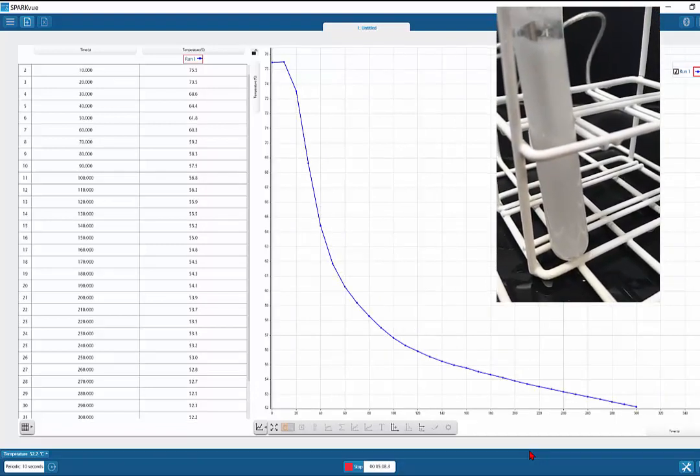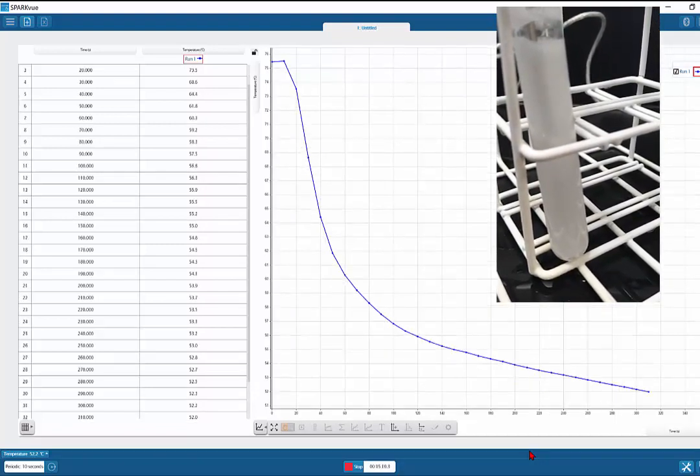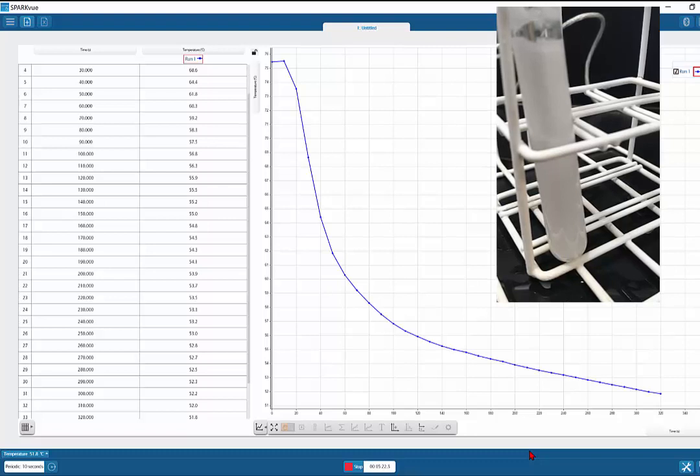And if we continue this experiment, we would then see afterwards that once all the state has fully changed, we would then be able to get another drop, because then the kinetic energy is not going into changing state. The kinetic energy is actually getting lost to cool the substance down and get colder. So we only see the first drop and level out in this particular experiment.